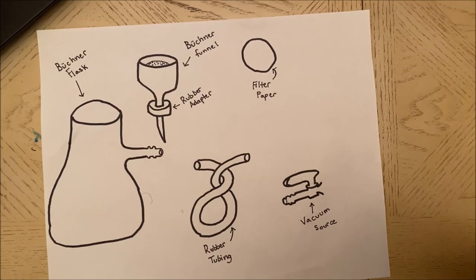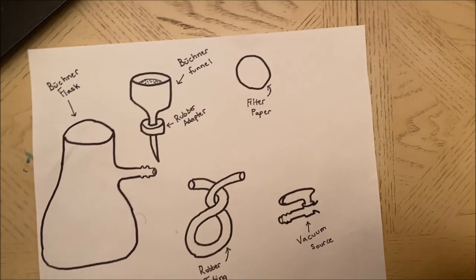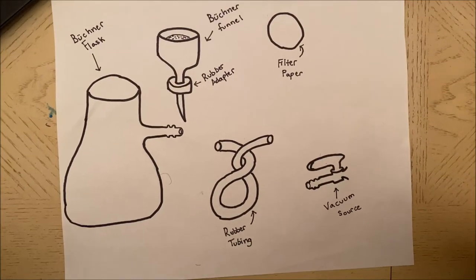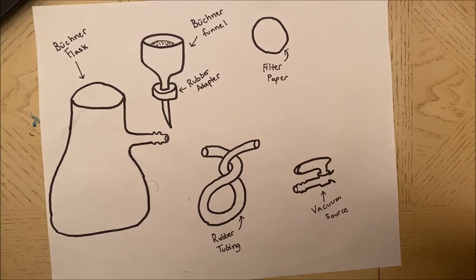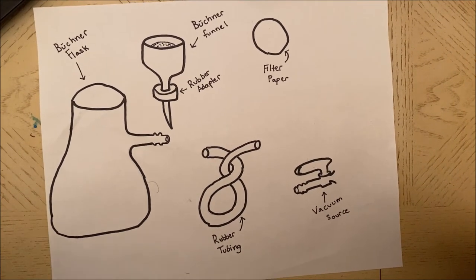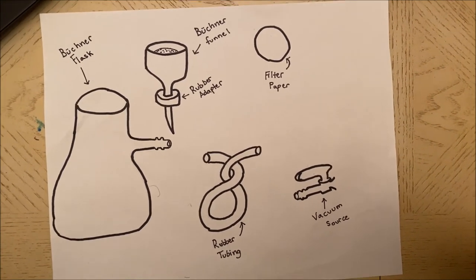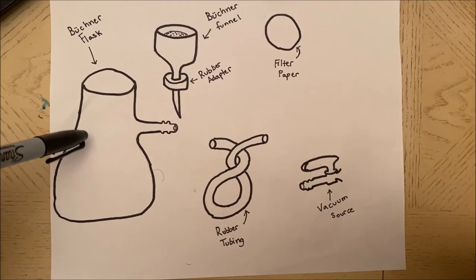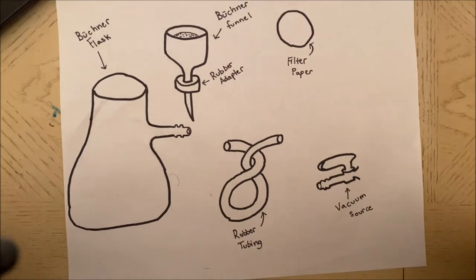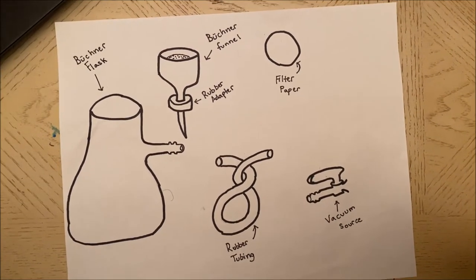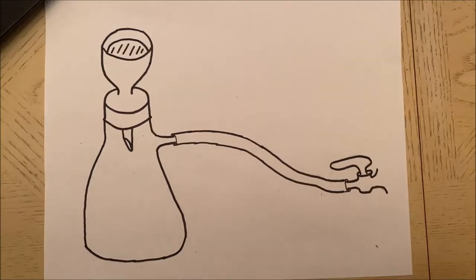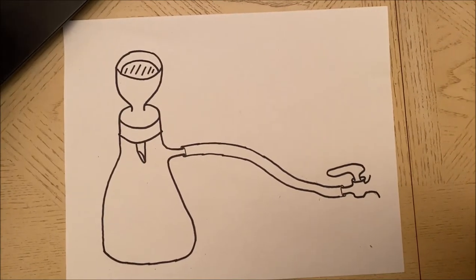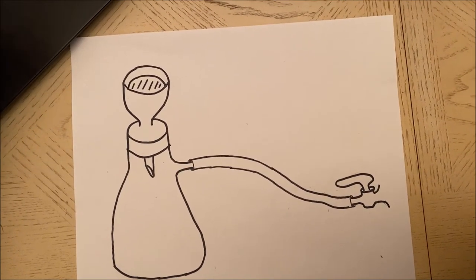Other things we need to make sure is that the vacuum is not strong enough to rip the filter paper, because at that point we will have to restart everything. In extreme cases we need to be careful because sometimes the flasks may break under the pressure, so we need to keep all of these in check when we are doing this.